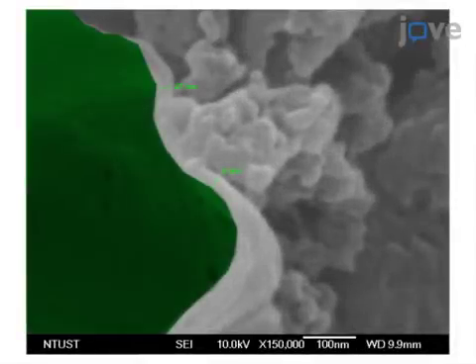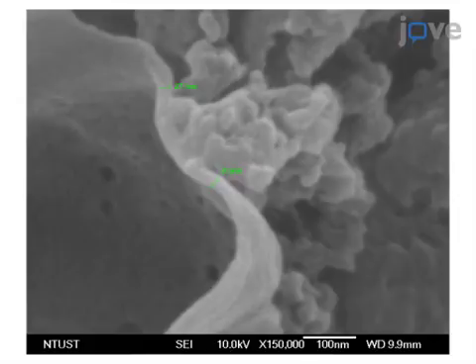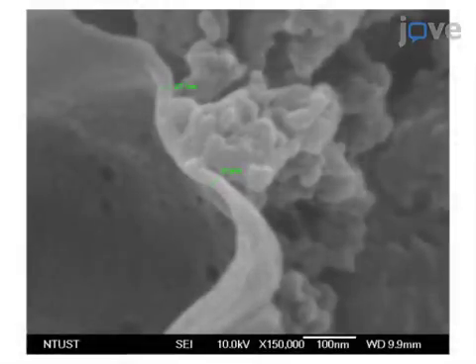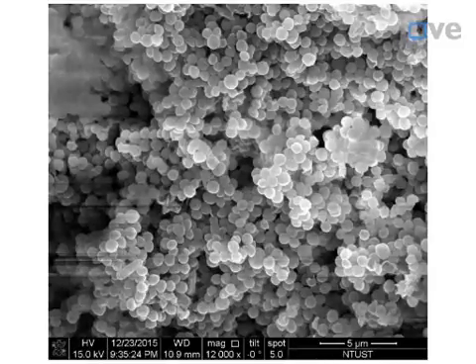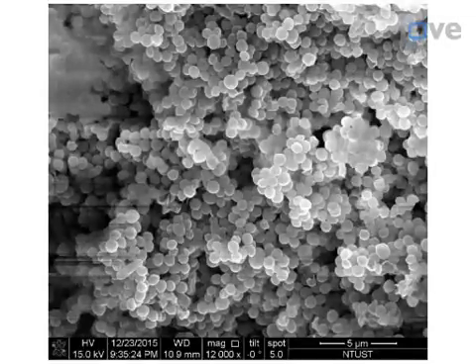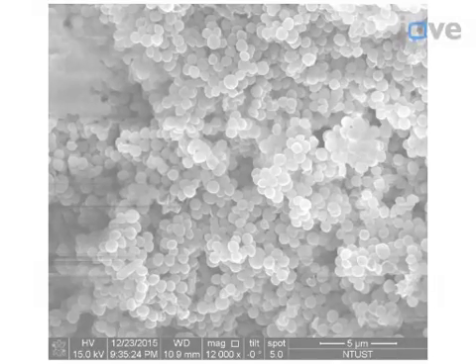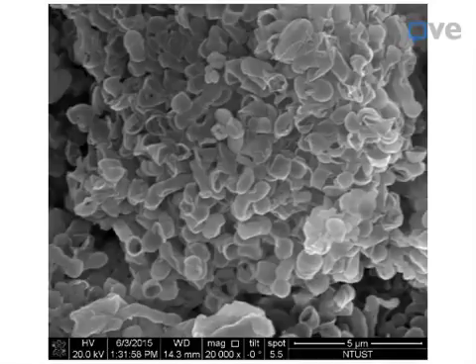This SEM image shows the broken hollow shell made of sodium tungstate which was excreted by Shewanella algae using glucose as the carbon source. Granules about 40 to 60 nm in diameter hang outside the shell. The shell itself is made of granules approximately 22 nm in diameter. Zooming out, one can see the length to diameter ratio for these hollow shells. These spherical shells have a length to diameter ratio of 1 to 1 and were obtained using a high concentration of metal oxyanions greater than 100 mM in the culture media. By decreasing the concentration of oxyanions in the culture medium to around 20 mM, the bacteria produces sodium tungstate shells with a length to diameter ratio of 3 to 1.